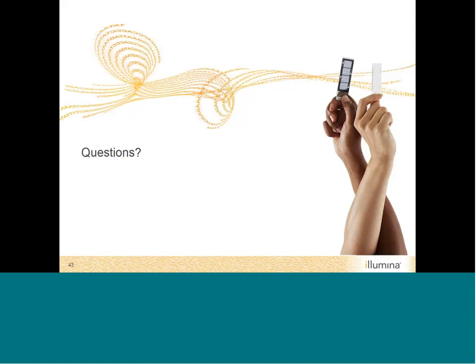All right. We have time, I think, for one last question. What's the advantage of the ligation extension approach? That's a great question. I would say both workflows are something that we have established. There wouldn't essentially be a clear advantage of one over the other. It's just two different ways to do this library prep.